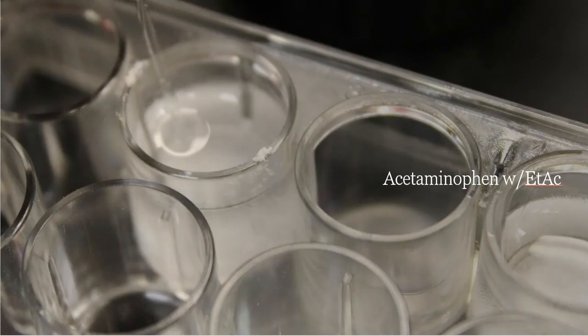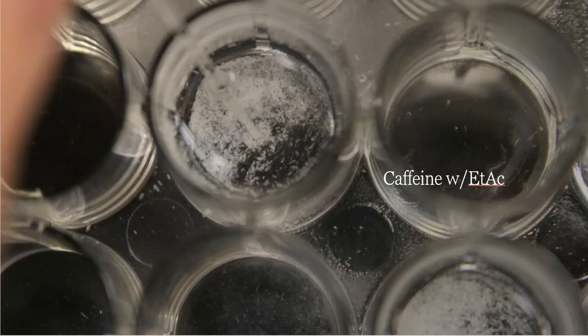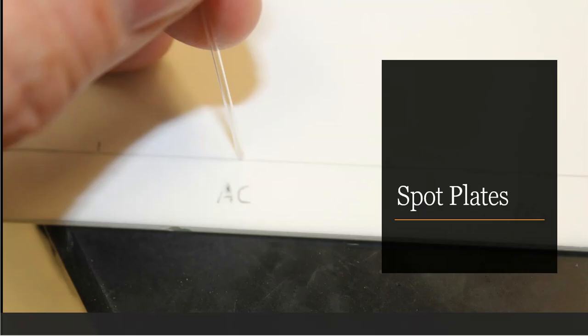All right, so next, acetaminophen with the ethyl acetate. I zoomed in a little bit closer so you could see this well. That way you can make your observations as you see fit. The acetylsalicylic acid with ethyl acetate, the zoom in is right there. Again, you can take a look at that and tell me how it looks to you. Here's the caffeine with ethyl acetate. Once more, I zoomed in so you could take a closer look of how this is behaving. The zoom in of ibuprofen, it's a little bit out of focus, but I don't think that you need it in focus fully. Here's ibuprofen with ethyl acetate, completely different than the other three. And then here's the unknown with the ethyl acetate. So once again, you can eliminate one choice based on how it's observing at this point in time. And now you've got a 33% chance of identifying the unknown the proper way.